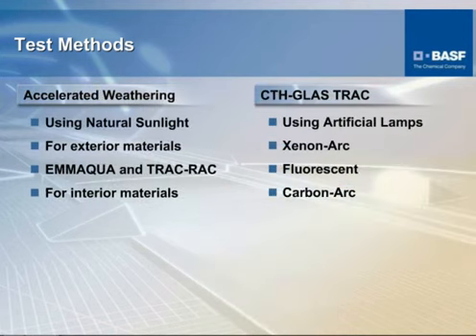We work very closely with the folks down in Miami. Monthly, they send us a breakdown of the exposure and time of exposure that our specimens were subjected to in South Florida. This slide here shows one of the test fields down in Florida, and as you can see, all of these specimens are mounted on racks, and they're mounted at different angles to the sun, depending upon the exposure that they can expect in their final application. Generally, these are washed periodically with fresh water to rinse away the salt from the atmosphere in Florida. That simulates the fact that, of rain. And as you can see, this is a tremendously large field, and this is only one of them.